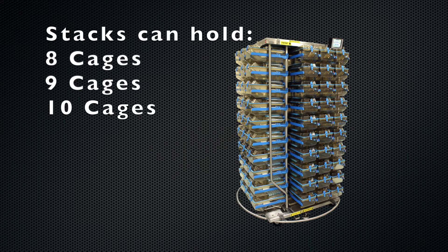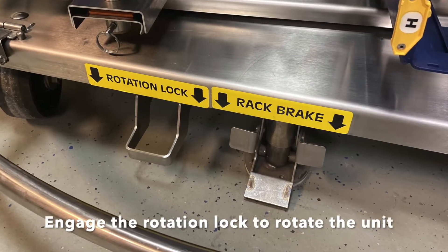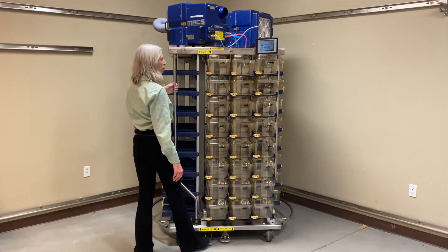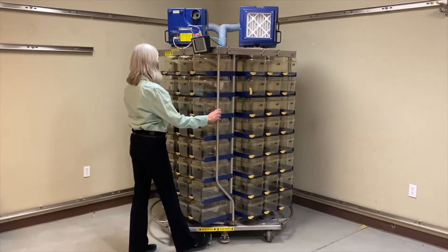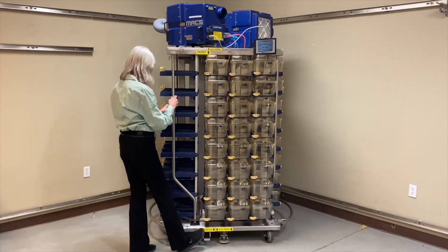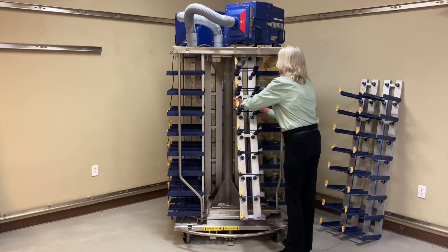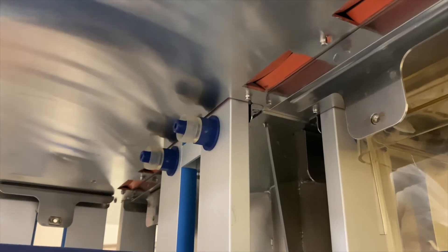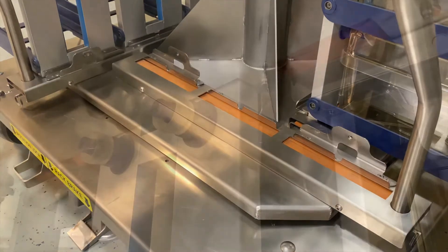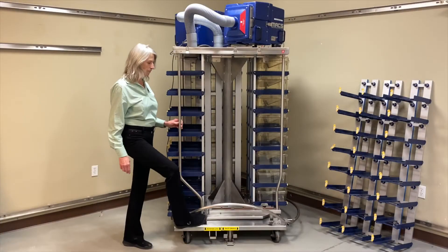The unit comes available in three different height options. Engage the rotation lock to rotate the unit. Although not necessary, stacks can be removed individually. Removable bumper guards protect the rack.